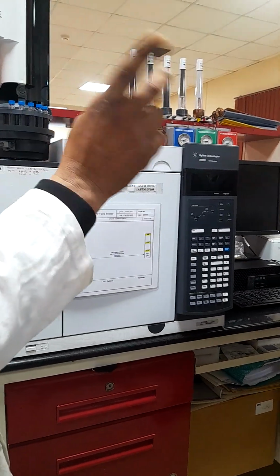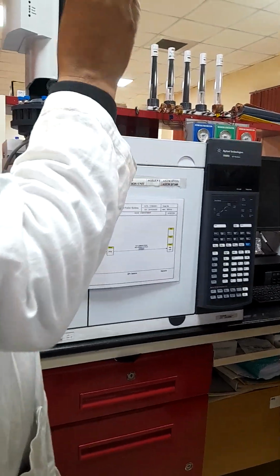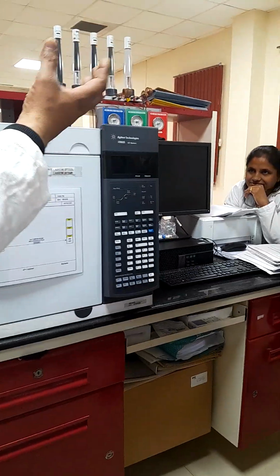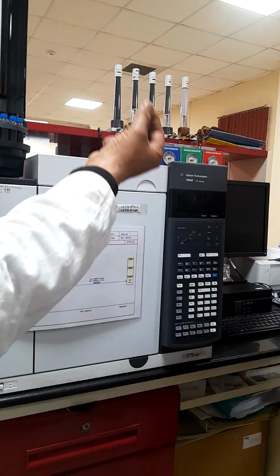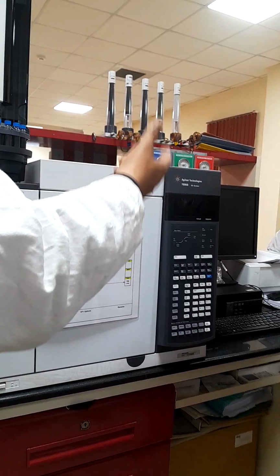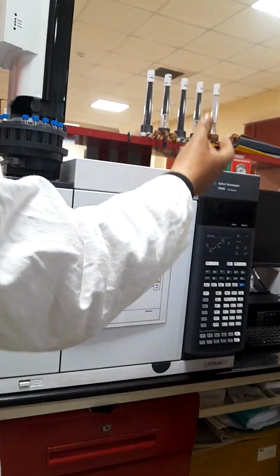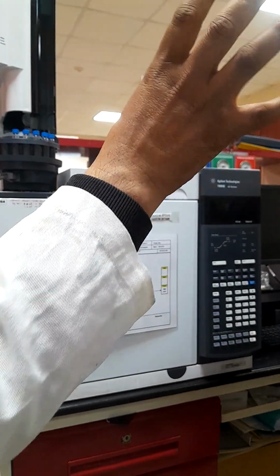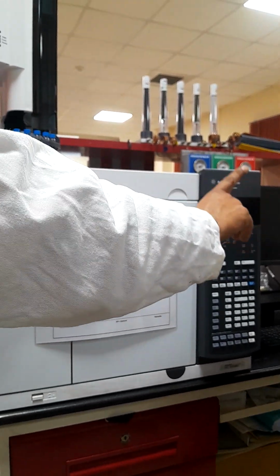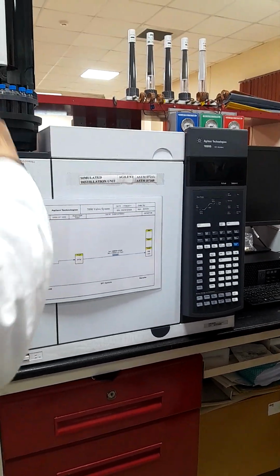How will the FID detect? You all have to study it yourself, because the detector part is from an analysis point of view. Every element or hydrocarbon has some flame and some wavelength on that flame. So the detector will electronically correlate with this wavelength number, and say this is a C5 hydrocarbon, and this is how much intensity it gets. That will be studied by the FID, but we will correlate with our calibration mixture, which we have earlier run on the GC.